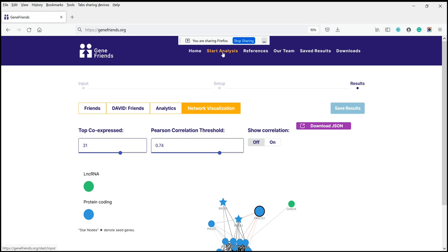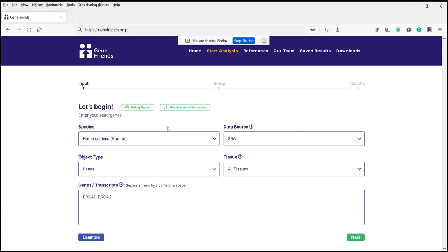Let's try a different analysis. Let's go back to start the analysis. Let's say we want to analyze a non-coding transcript. One of the advantages of GeneFriends is that it has many non-coding genes and non-coding transcripts, as well as different splice variants. BRCA1 and BRCA2 were protein-coding genes, but let's use something different — this is a transcript, actually from a microRNA.